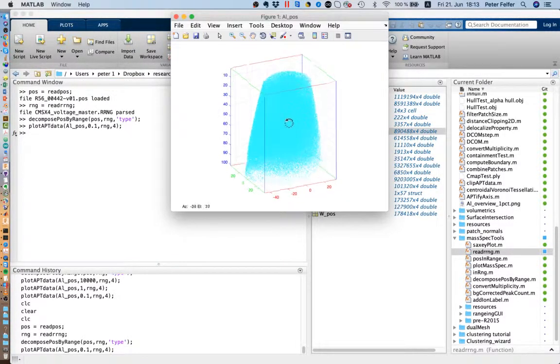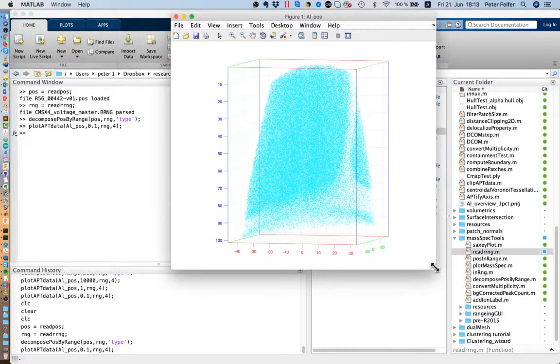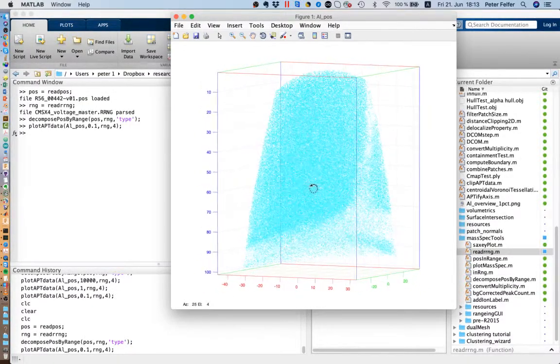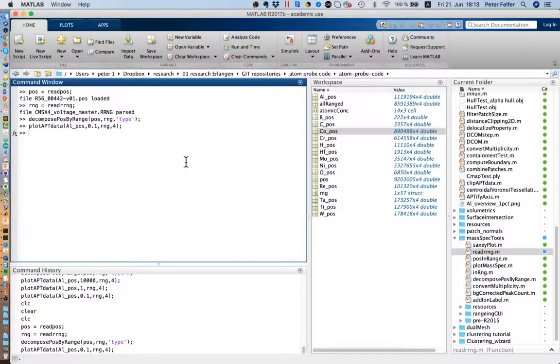You push that, then you get an atom probified axis system, so everything is white in the background. Then the z-axis is inverted, and it will straight away plunge you into rotation mode. Okay, very simple. Gets you started in Matlab with your atom probe data very quickly.